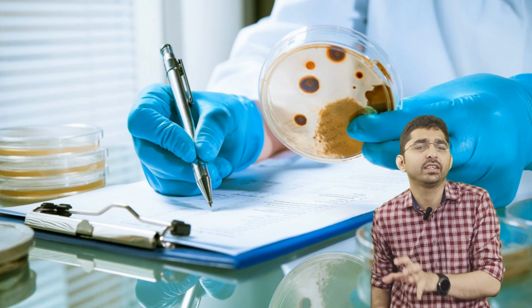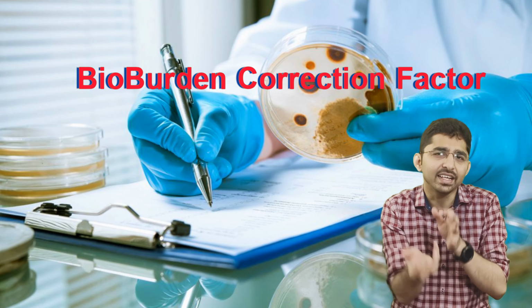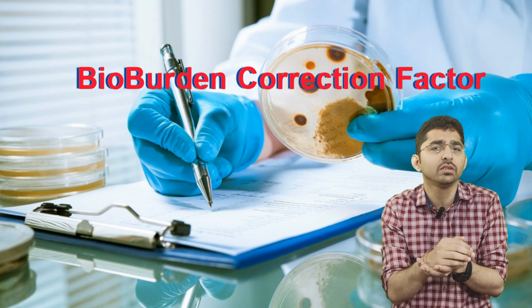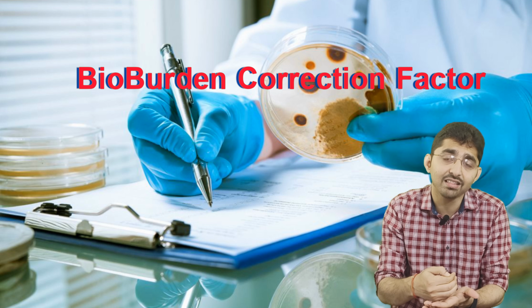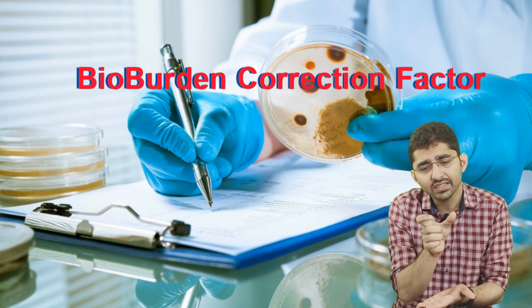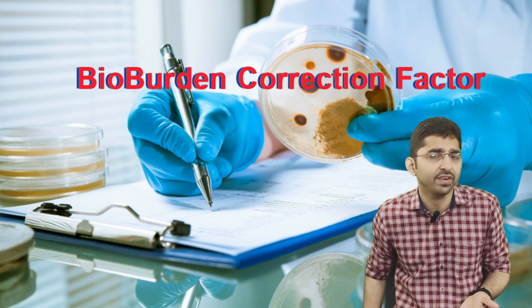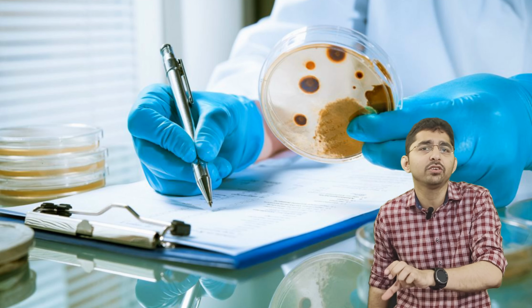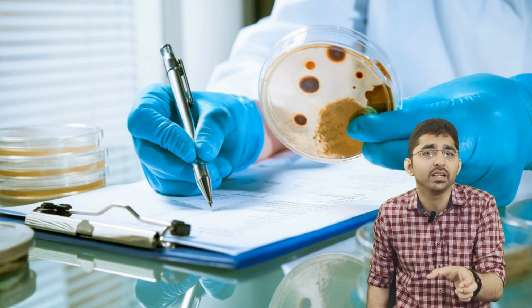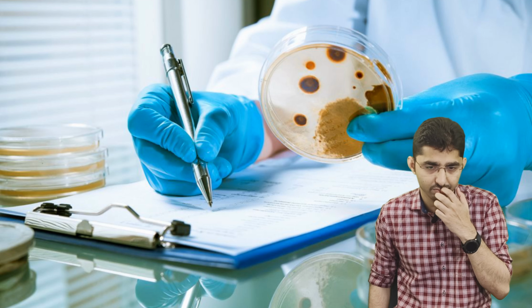Bioburden correction factor. So my friends, once a medical device gets sterilized, then after sterilization, how many microorganisms are still there, right? So that amount is represented with a correction factor, I mean the bioburden correction factor. A factor on the basis of which you need to re-correct your bioburden. I mean you need to reduce the bioburden. You need to go with the bioburden test once again, right? Clear.